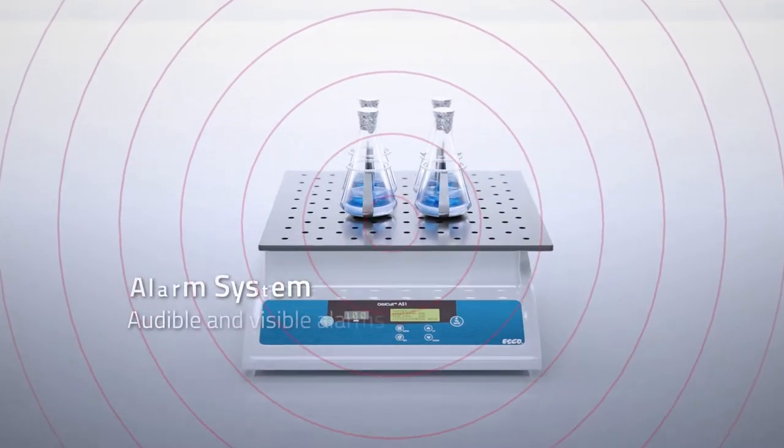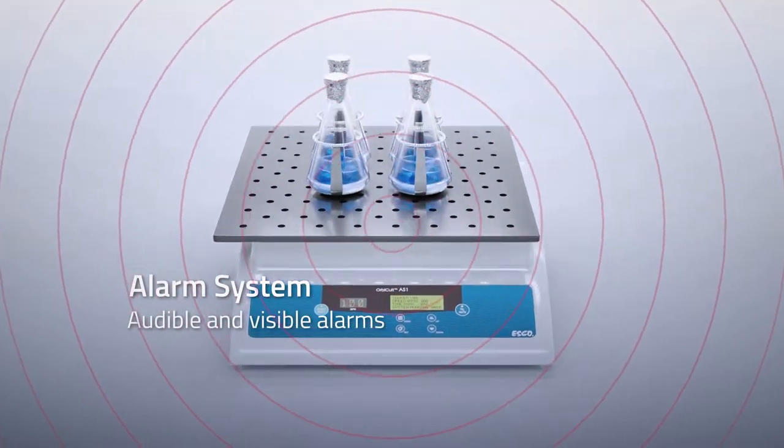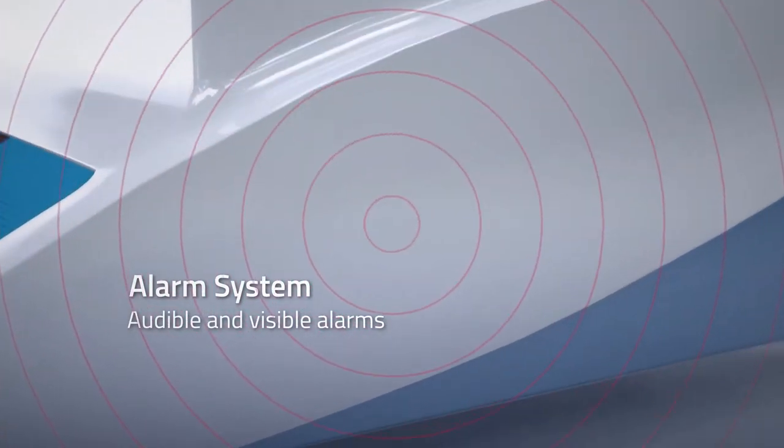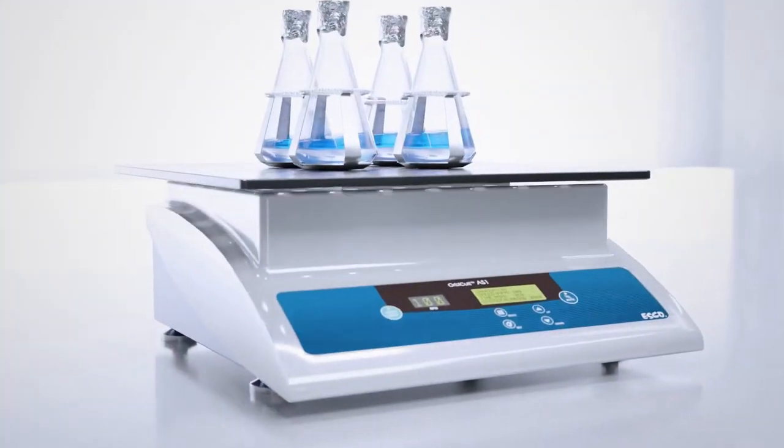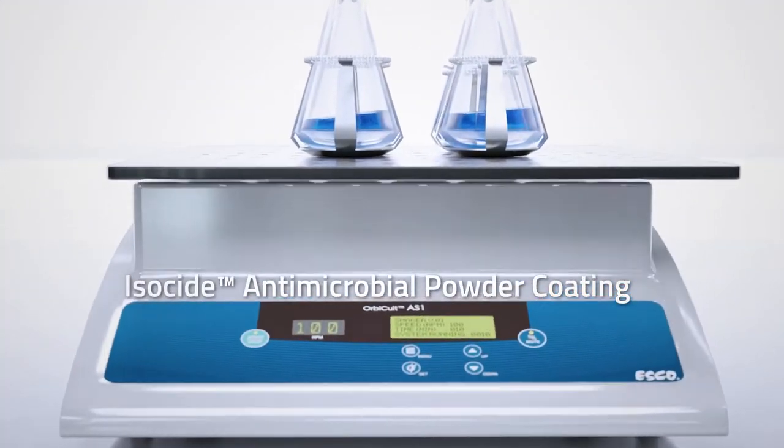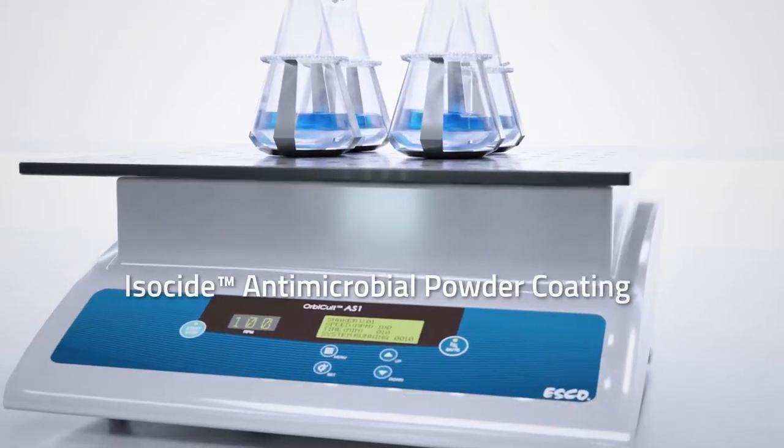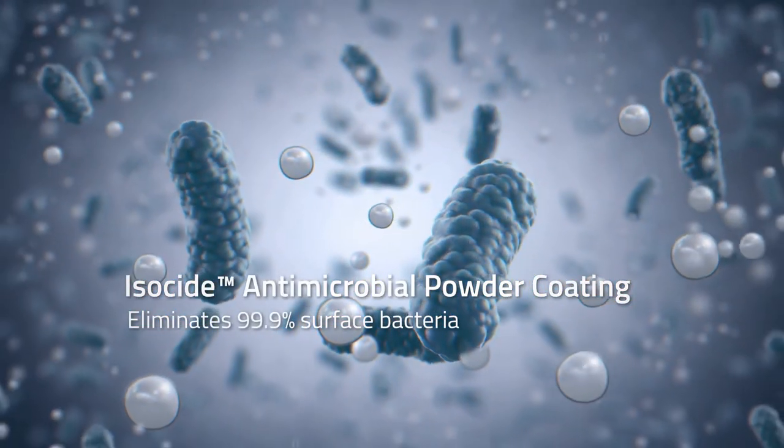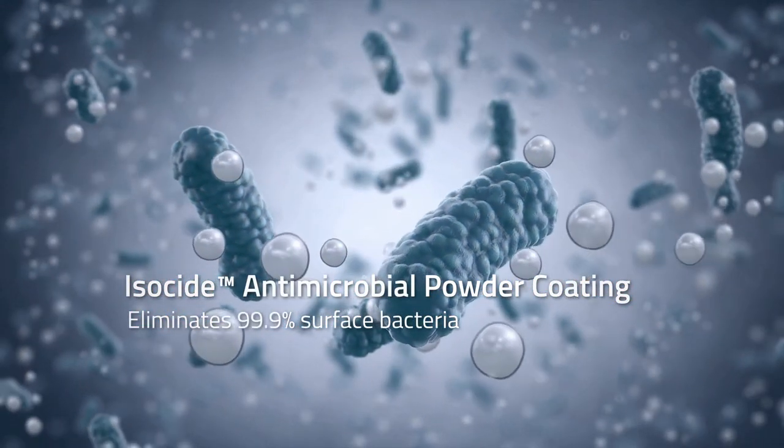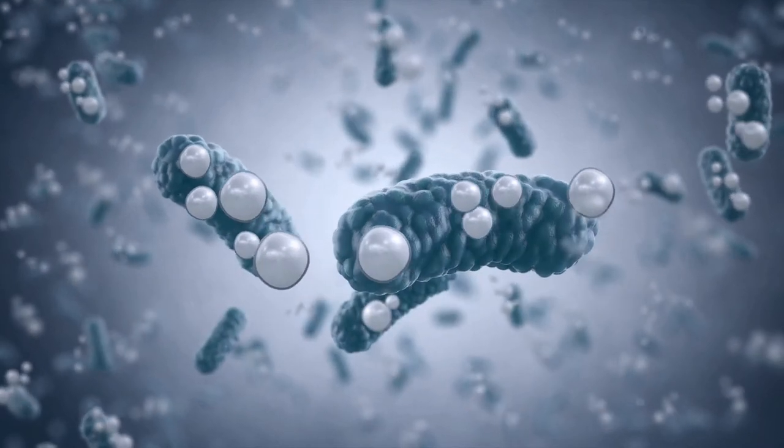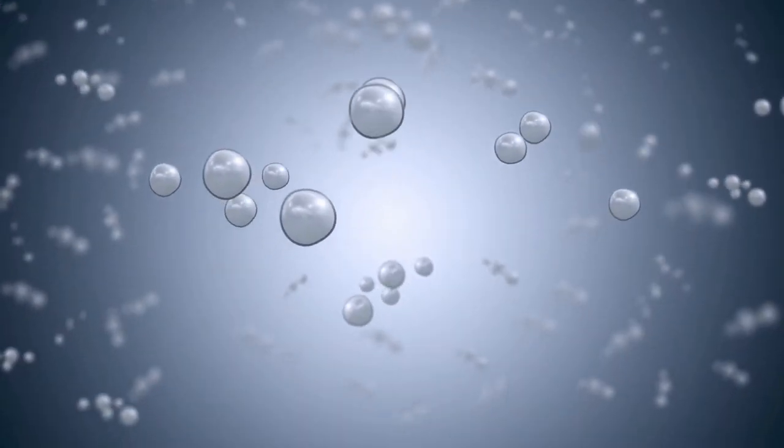Alarm system with audible and visible alarms that alert any undesirable situation. Built for safety with iso-side antimicrobial powder coating. It eliminates 99.9% of surface bacteria within 24 hours of exposure.